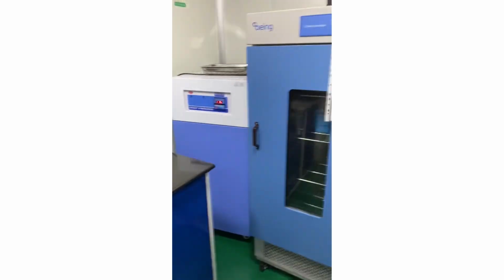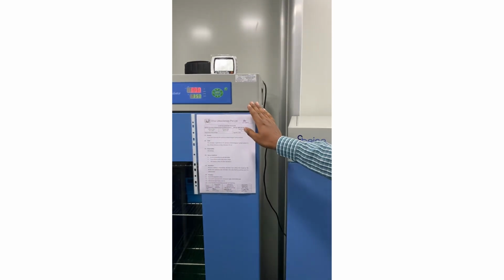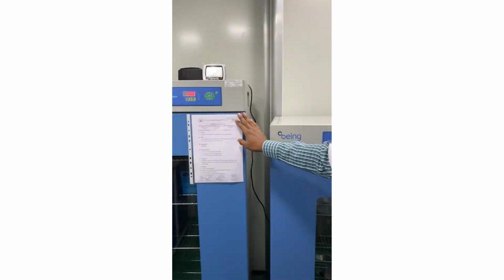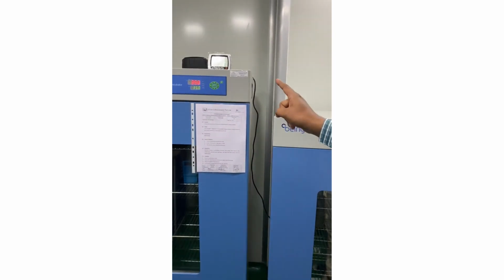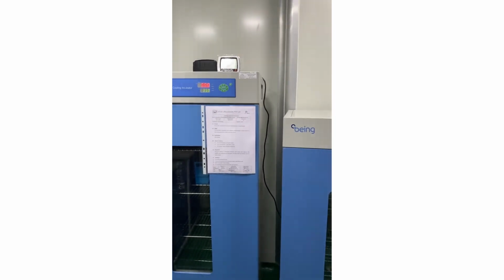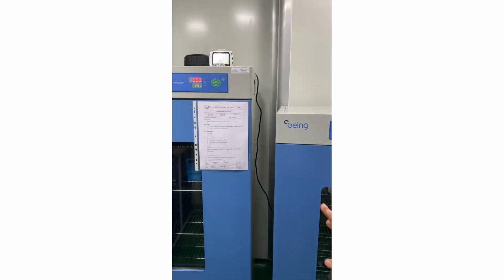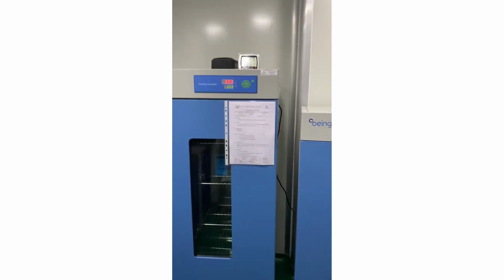This incubator is for bacteria and pathogens like E. coli, coliform, and Salmonella. Those organisms we are growing in this incubator at a temperature of 35 degrees centigrade. It should not switch off. One sample analysis will complete after 48 to 72 hours. We need 72 hours to cultivate the growing microorganisms.